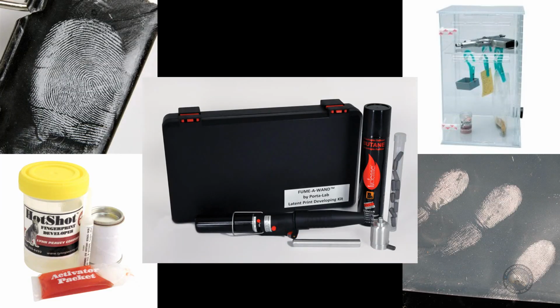We're going to move on to my favorite technique, and that is superglue fuming. I've used this hundreds and hundreds of times at all different types of crime scenes, all different types of textures and types of evidence. It is one thing that I recommend you master because it protects the print so well, especially during transport. It also locks in the DNA for lab analysts to get to. Superglue is approximately 98 to 99% cyanoacrylate ester. It's a chemical that interacts with and visualizes the latent fingerprint so that we can see it.